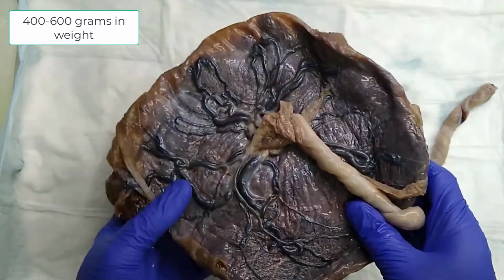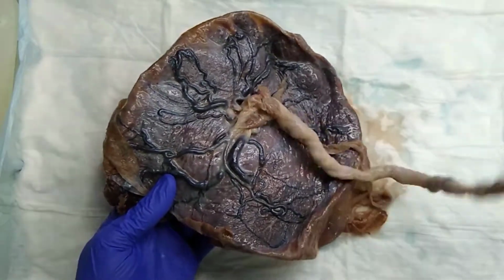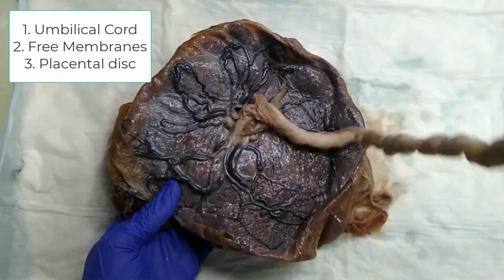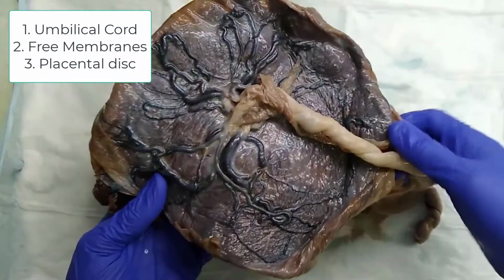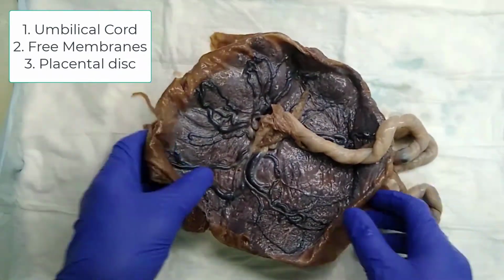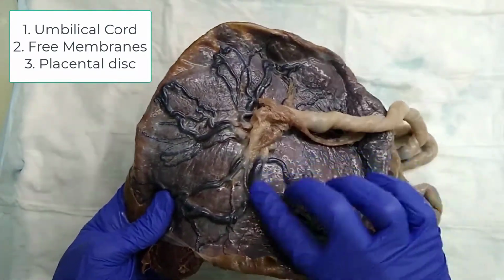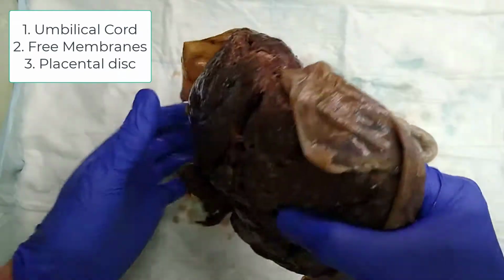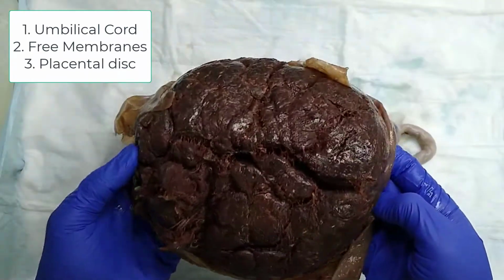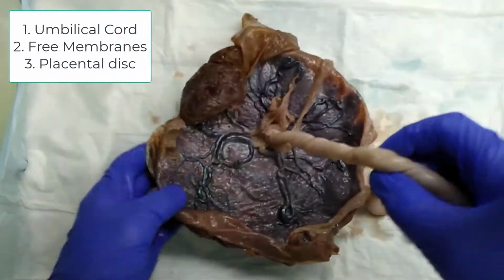The placenta is examined in three compartments. One is the umbilical cord. Second is the free membranes. And the third is the placental disc, which has two surfaces, the fetal surface and the maternal surface. So we'll start with the umbilical cord.